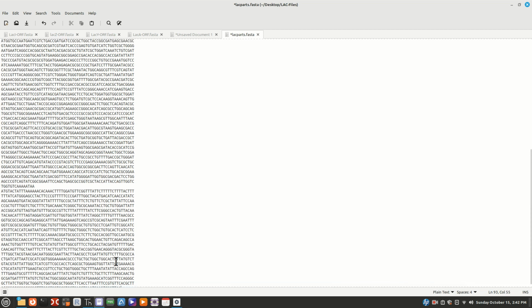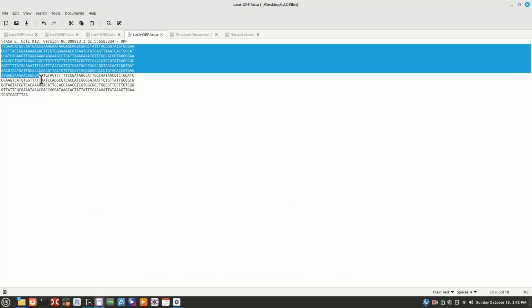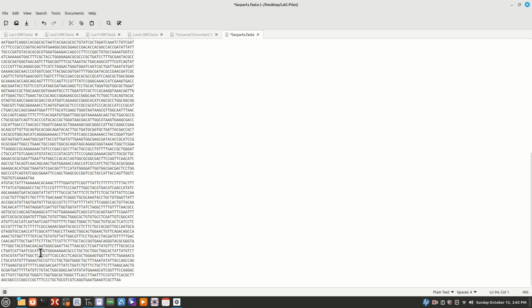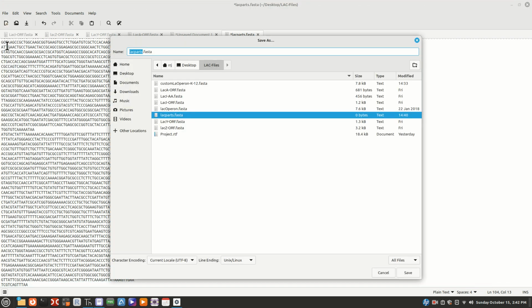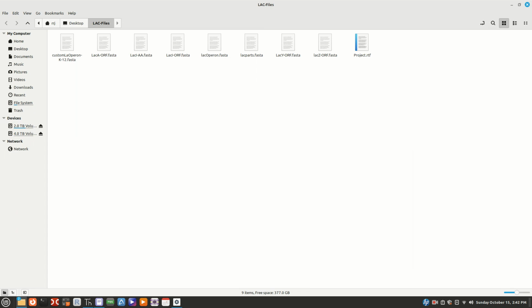All right, and then I need what? A. Like A is small. All right, now I have essentially I, Z, Y, and A all in one piece. I'm going to save that. Actually, I already have it saved as that. We'll replace. Okay, so now let's go do a dot plot with all of these.